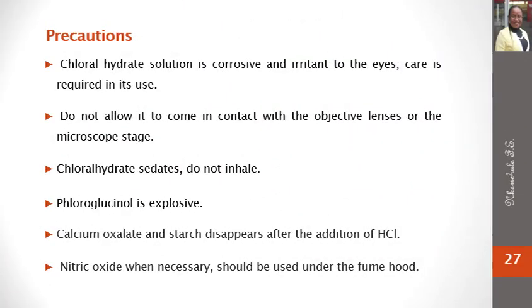There are some precautions that you have to note before starting with this experiment. Number 1, chloral hydrate solution is corrosive and irritant to the eyes. So you have to be careful how you use it. Do not allow it to come in contact with the objective lens of the microscope or the stage because it could corrode the cementing layer. Also, it sedates, so do not inhale.